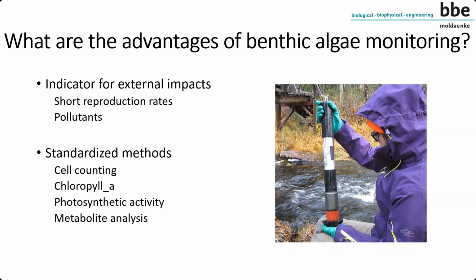And of course, we have the possibility to make the analysis of the different metabolites, some of which are produced by the Microphytobenthos, but also some of the biotoxins. But this is, of course, laboratory analysis and cannot be done at site. But this is also something which I have to mention here. Some of these methods can be done in situ, and that means at site where we take the samples. Other samples have to be transported to the laboratory and analyzed later on.